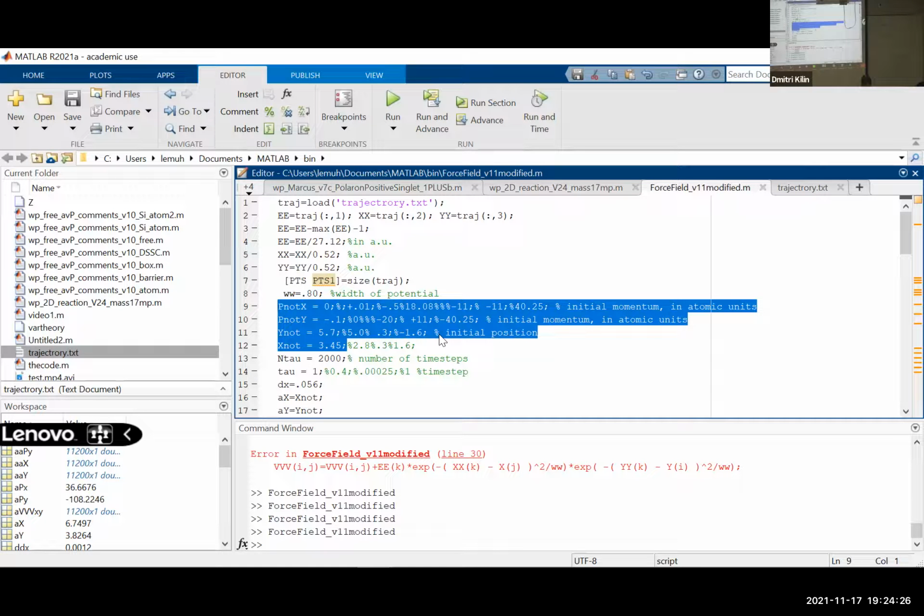If quantum will not work, you can do maybe 10 or 20 different runs and report how you see the reaction going through. And just make images for separate runs. Makes sense? Okay, so now you have a backup plan. Now let's try to torture your computer.